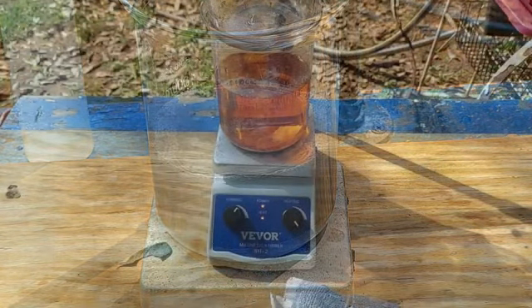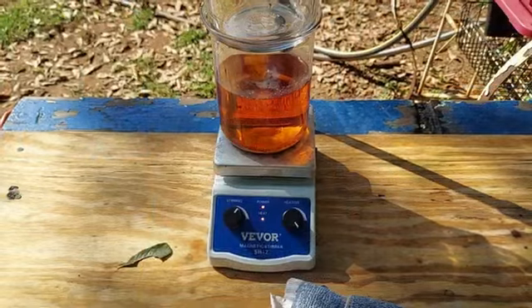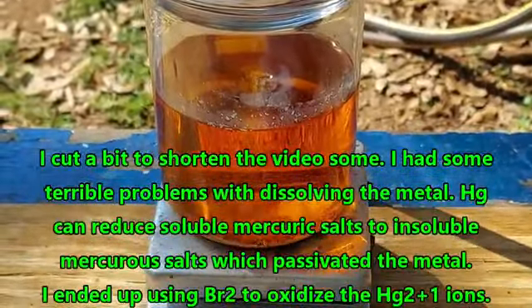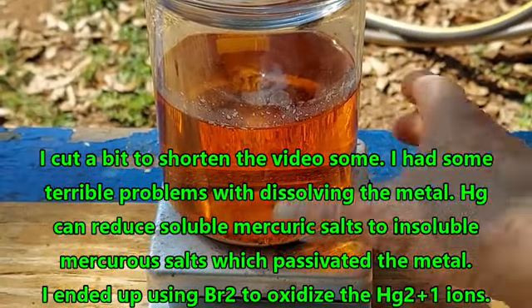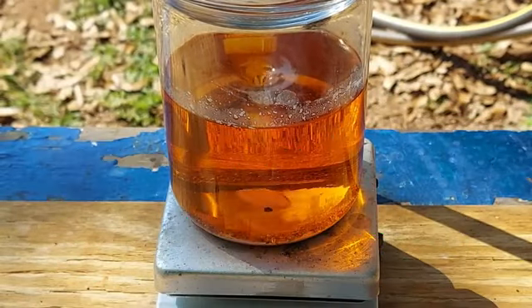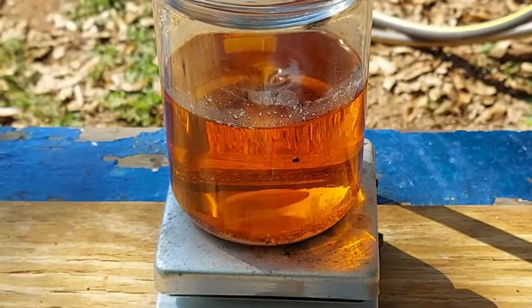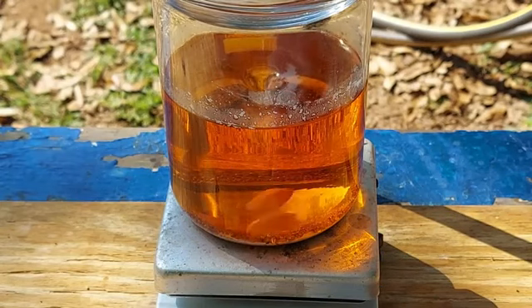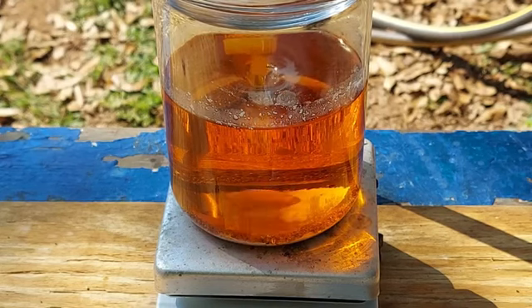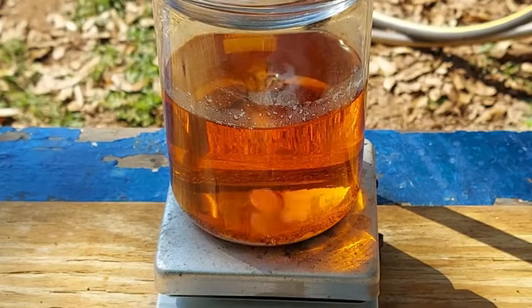Alright, if it has decided that it wants to stay in focus this time, there we go, you can see. So, adding the bromine and just very gently heating this, it's barely warm to the touch, was all it took to completely clarify the solution. Because halogens are so useful, I swear. I don't know how people do chemistry without having chlorine and bromine readily available, because they're just so useful and so handy to have around.